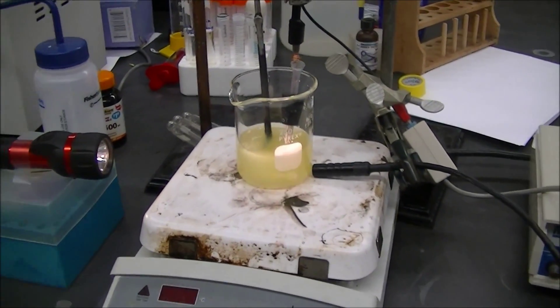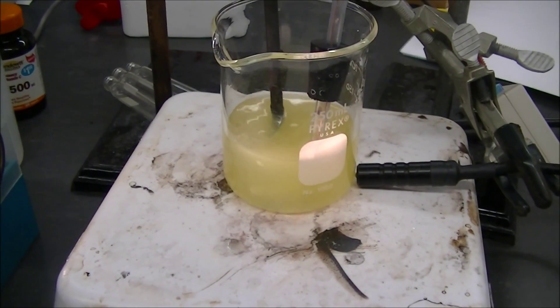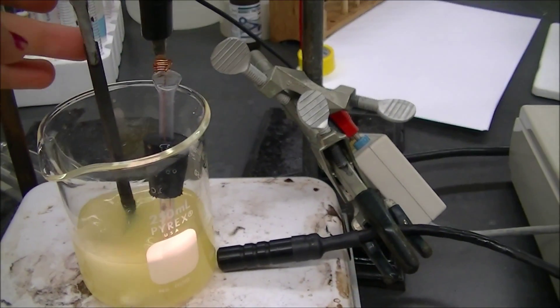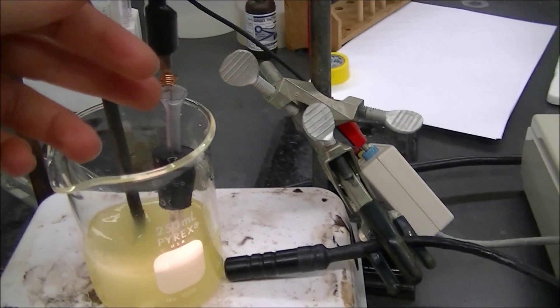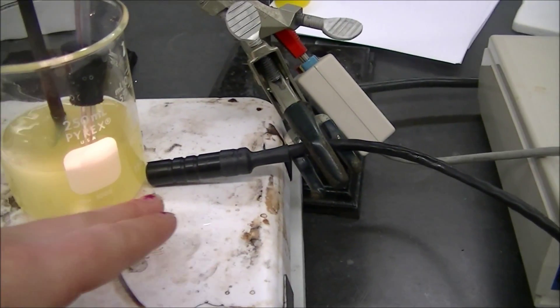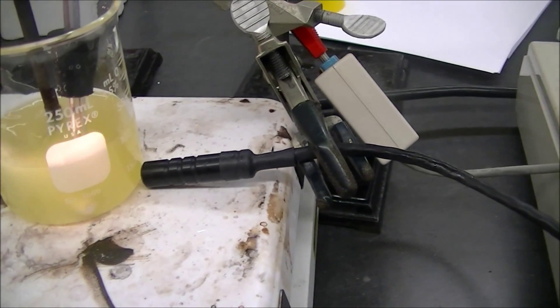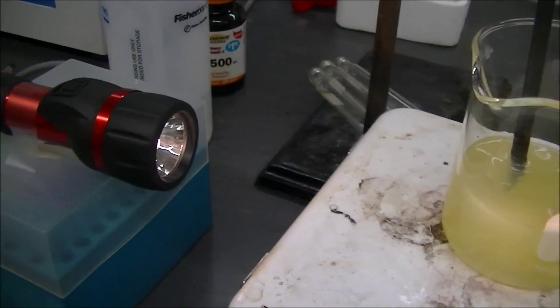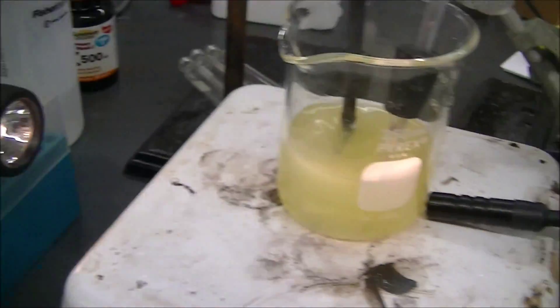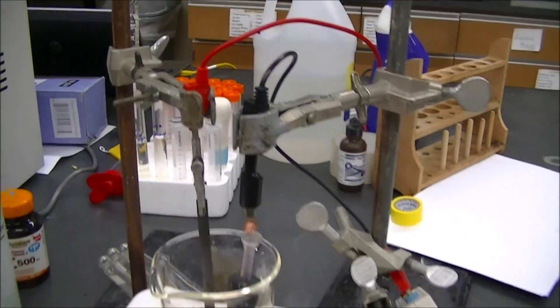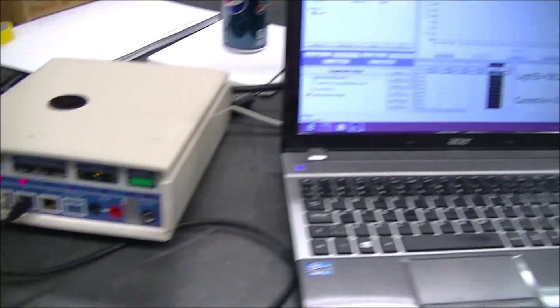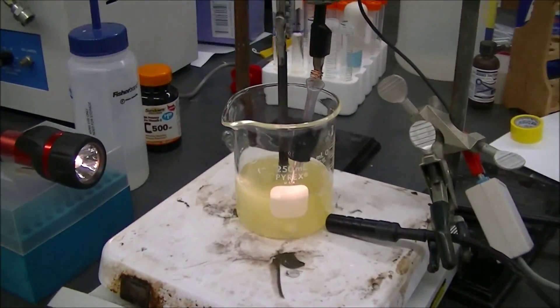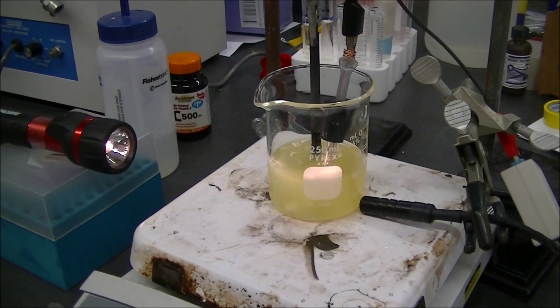So here's our setup. We have our solution right here, you can see it's spinning. Then we have our carbon electrode here and our platinum electrode here. Then we have our photo sensor, you can see it's touching right up against the glass so there's no extra light coming in. Then we have our flashlight over here shining on it. It looks very nice and all set up, hooked through Microlab to the computer.